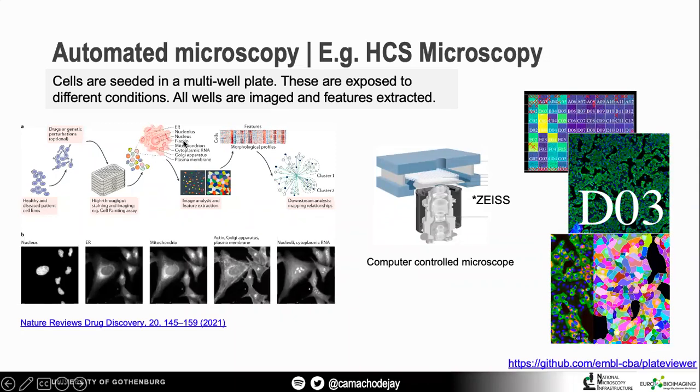All right, so once we have those images, we have all of those conditions, and we have all of these tables of descriptors, that is when the bioinformaticians usually jump in, because now they have humongous data tables, and they are capable of mining all of that information to try to explain the biology behind it, all right? So the purpose of today is mainly to describe how we go all the way to the data tables.